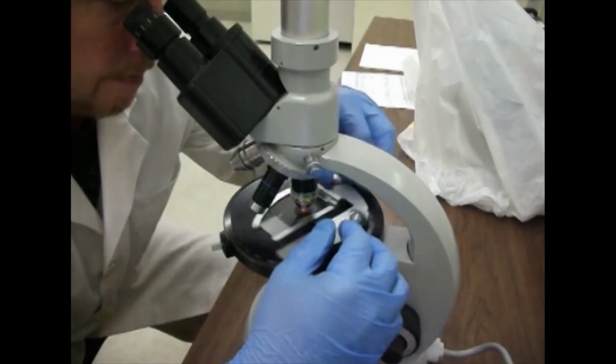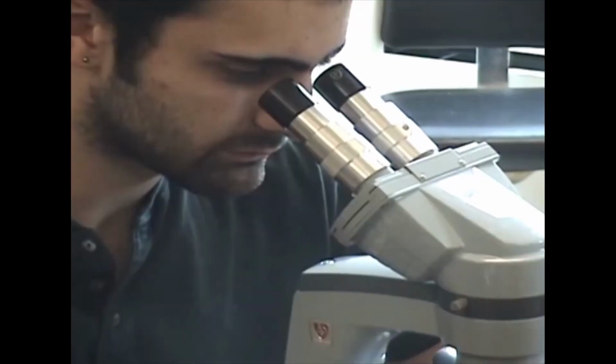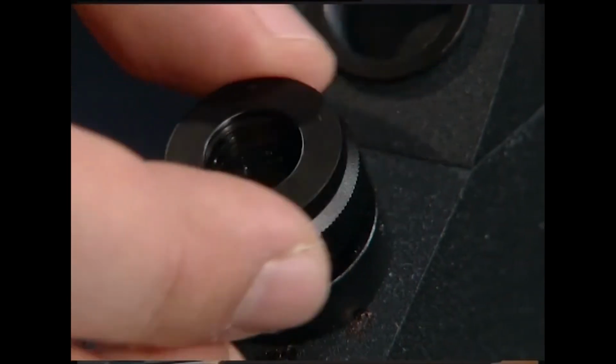The petrological microscope is a basic lab tool for a geologist which assists in identifying the optical properties of the individual minerals or the minerals present in a rock. Refractive index is an important optical property which helps in the identification of ordinary minerals and gem minerals using a refractometer. In fact, minerals which possess similar physical or other optical properties can be distinguished with the help of refractive index.